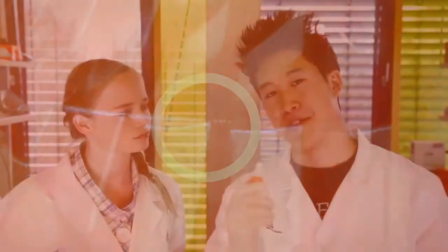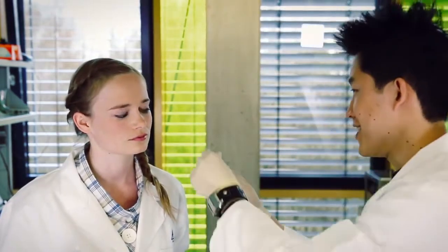Spacers — who needs spacers? The M-tubes have none, and that's perfect for tissue homogenization for molecular or microbiology analysis.